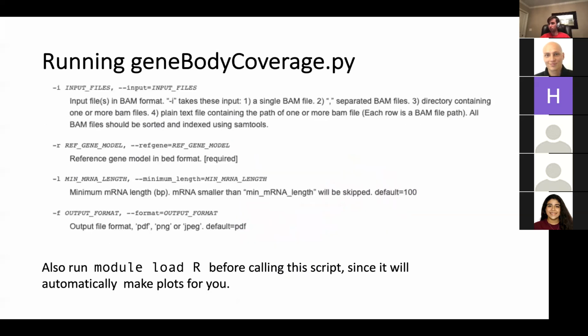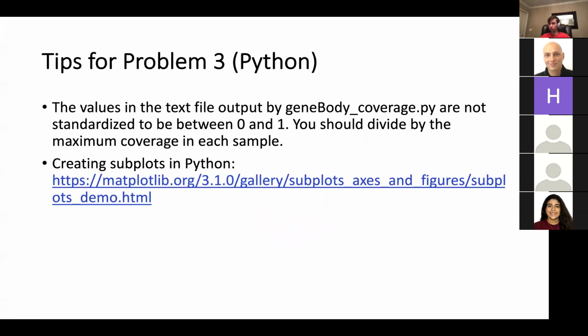For problem 3, what type of data structure do you recommend we get the data into? For example, I tried to use a dictionary and then an ordered dictionary, but it's difficult to then call indexed values. That's a good question. Could you read it in as a string and split that string up, because you know that each one's 100 long?